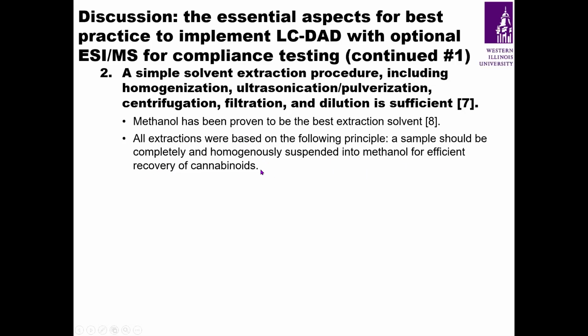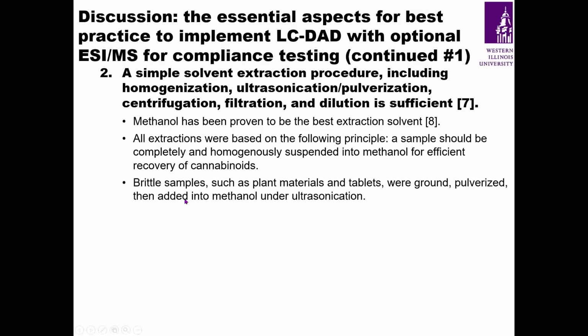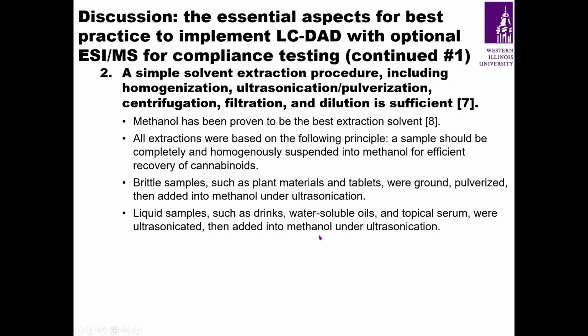In case we are dealing with new, unanalyzed samples, this is the principle to figure out the sample preparation procedures. Now, specifically for brittle samples such as plant materials and tablets, they were ground, pulverized, and then added into methanol under ultrasonication.